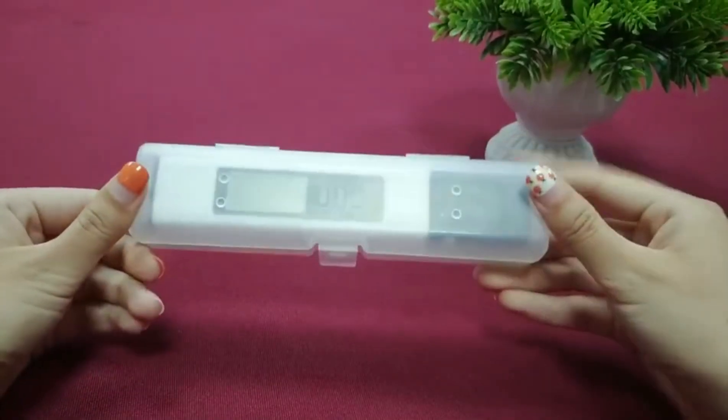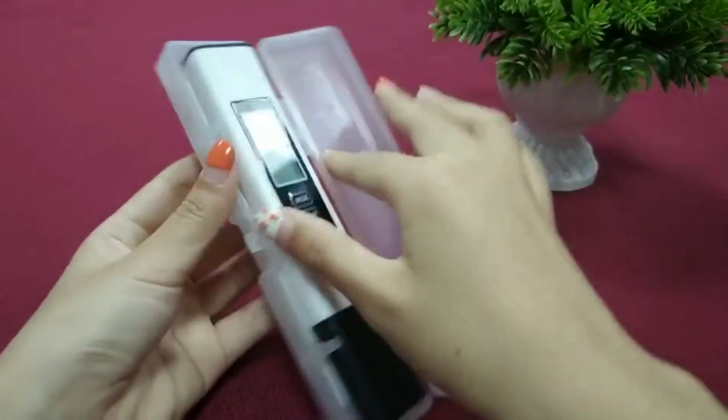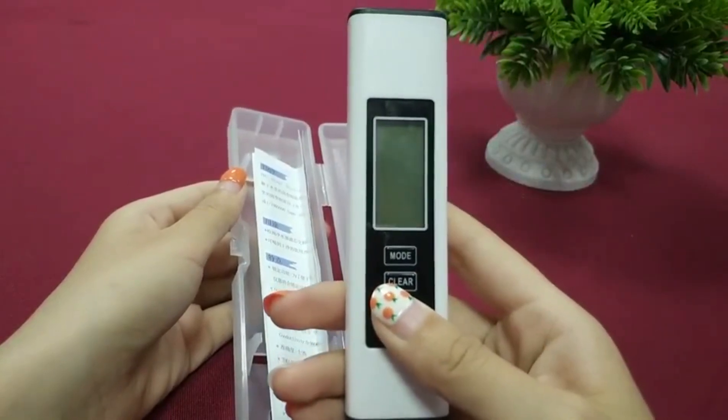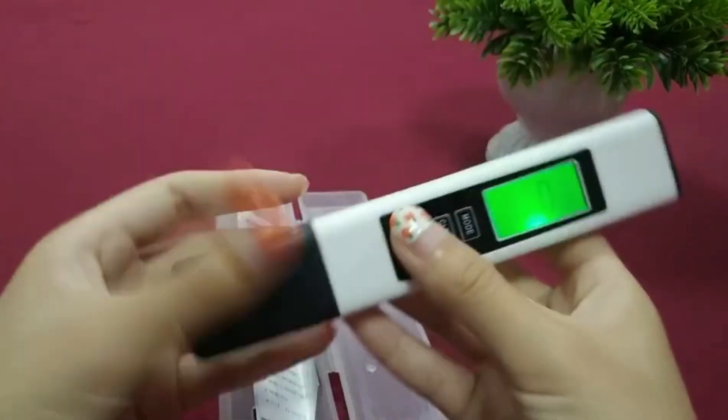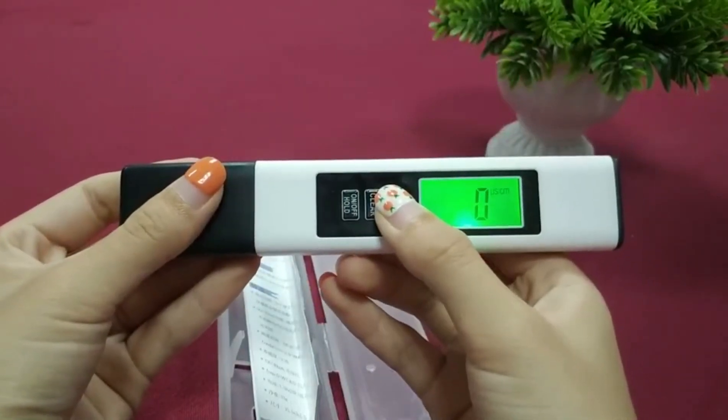TDS Meter gives you fast and reliable results with a high-precision chip and titanium alloy probe. Easily measure total dissolved solids, TDS, in your water to ensure it's clean and safe for your family. This handy device measures TDS, electrical conductivity, and temperature all-in-one.